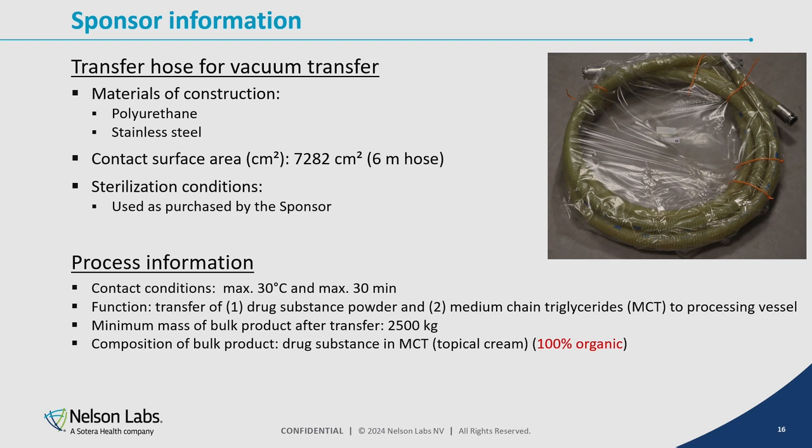The minimum mass after the transfer of the ingredients to the large processing vessel was 2,500 kilograms, and the product that's made is actually a drug substance in medium chain triglycerides, so a topical cream which is composed of 100% of organic ingredients.